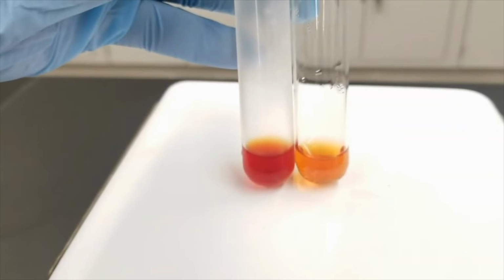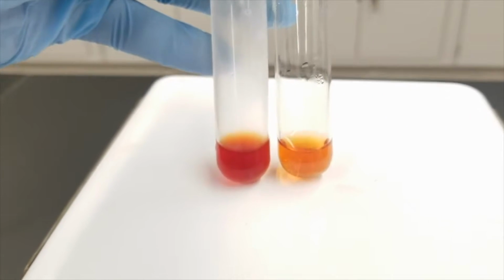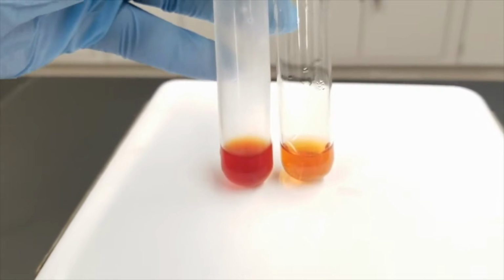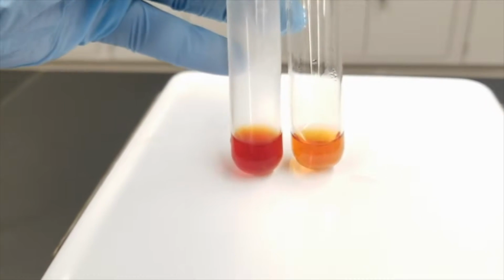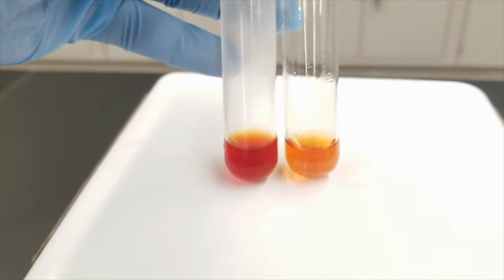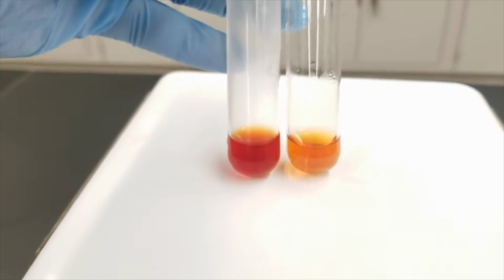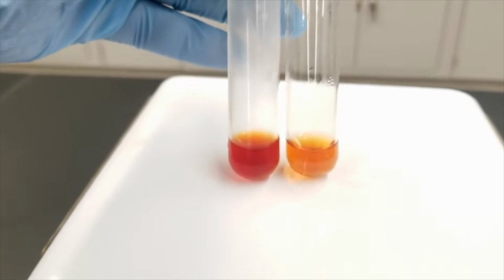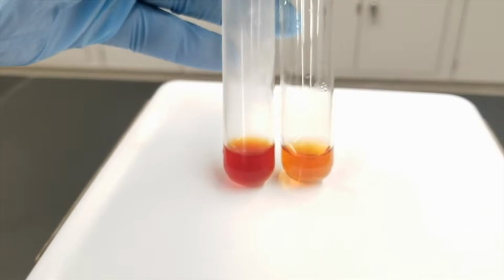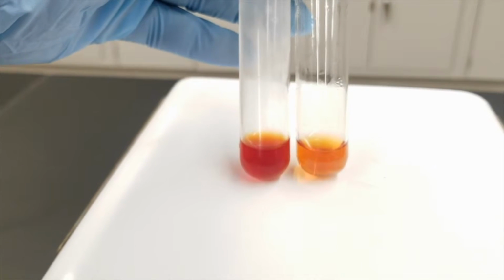Okay, so here I've gotten our two test tubes. Test tube 5 on the left, that was in the ice bath. Test tube 6 on the right, that was in the hot water bath. And hopefully you should be able to clearly see the difference between them. It's a little bit more subtle than some of our other test tubes, but again, you should be able to tell a difference here and tell which one shifted to the reactant side and which one shifted to the product side.